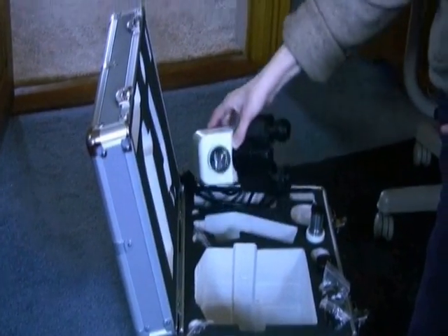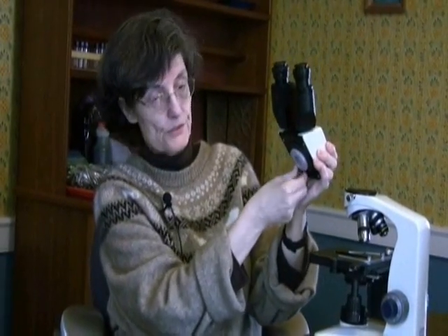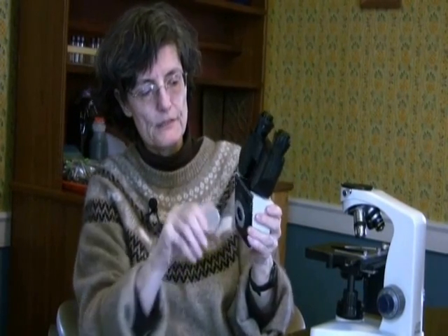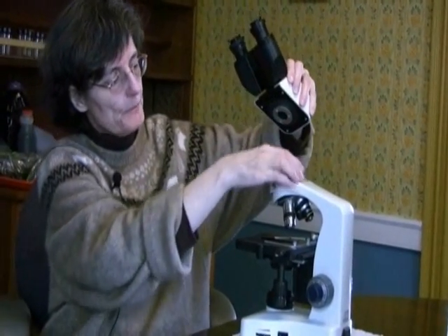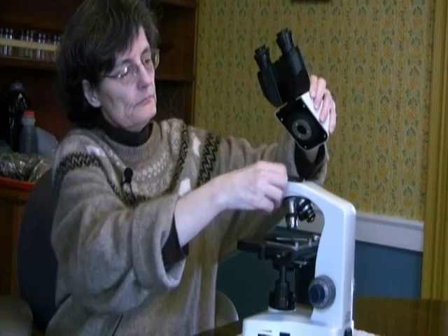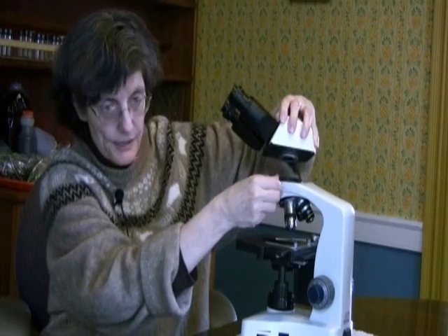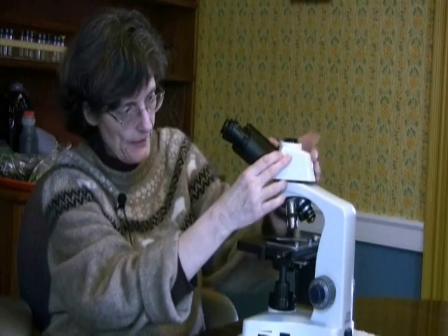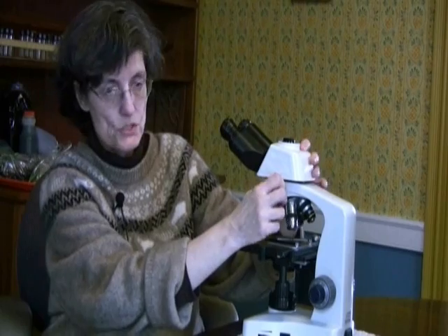Looking through all the materials in our container, we're going to pull our headpiece out. Typically on the bottom of your headpiece, when you first get this, there is a closure. So you're going to have to pull that off. It can be a little tricky. When you look at your headpiece, it has an indented piece that slides in here. And you just have to make sure that this screw is all the way out, so it's really easy to sit that down in there and make sure that it turns. All you have to do is tighten down this screw.